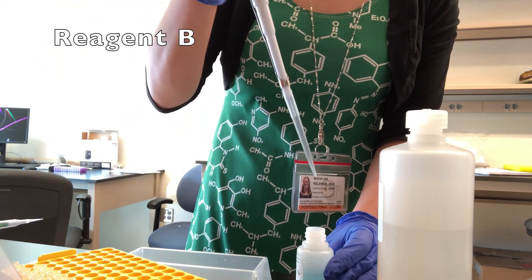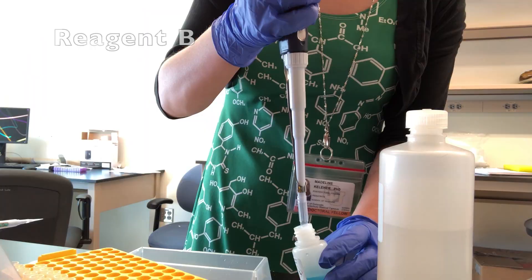Then I add reagent B, which has cupric sulfate. When the copper from the cupric sulfate comes into contact with protein, it will lose a charge, going from plus 2 to plus 1. Any of the copper ions that are plus 1 will be turned purple by the bicinchoninic acid. So the more purple you see, the more protein there is.